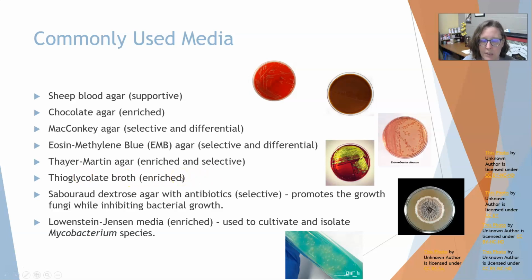We often use it after we've swabbed and inoculated the cultures on the plates. We also often inoculate a thioglycolate broth for testing later on in case something happened with the plates or things didn't work out or we need to go back for more sample.